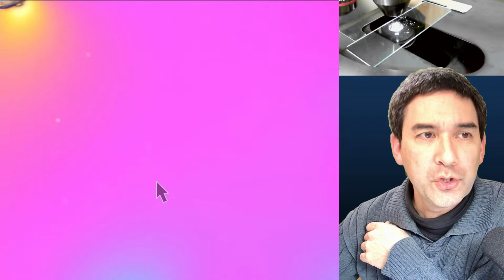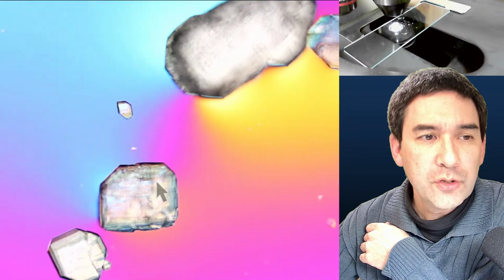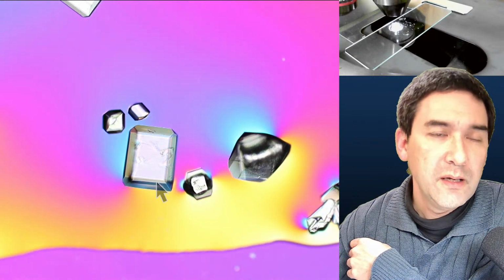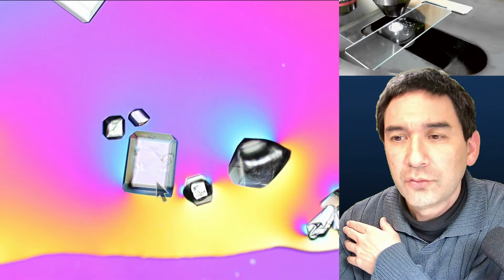And depending very much on the temperature, on the concentration, and so on, essentially the shapes can look very different. So see, these start to recrystallize quite nicely, and what you can do, with a lot of patience, is a little bit of a time-lapse video and then see how they're actually growing.